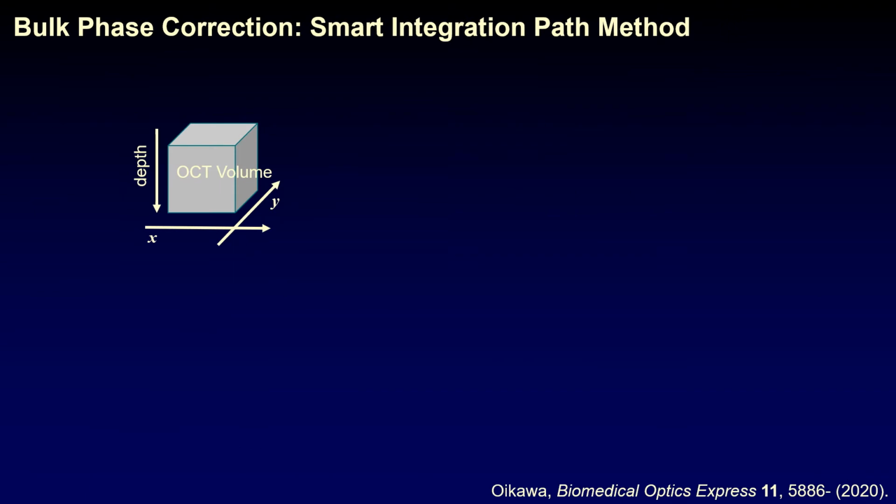The concept of holographic refocusing itself is somewhat old, but its implementation for real samples is a little bit difficult, especially because of the depth-independent phase error which occurs during the measurement. To estimate and remove it, we built a new algorithm.